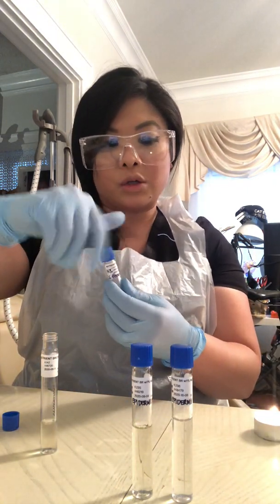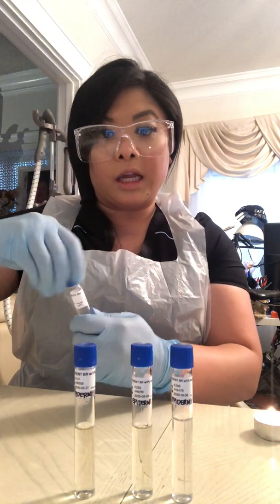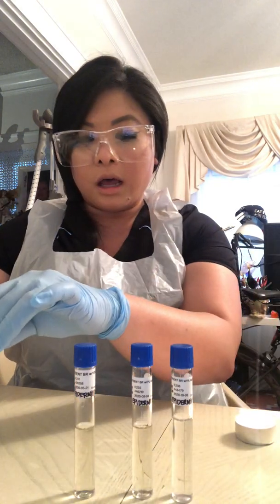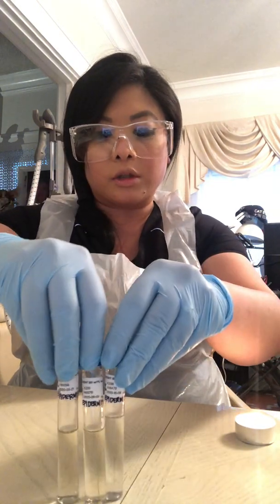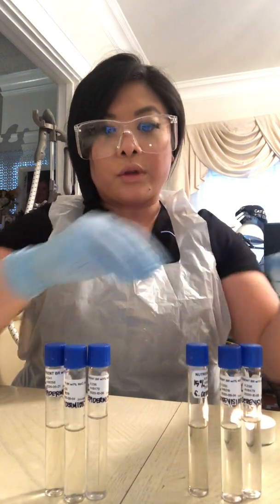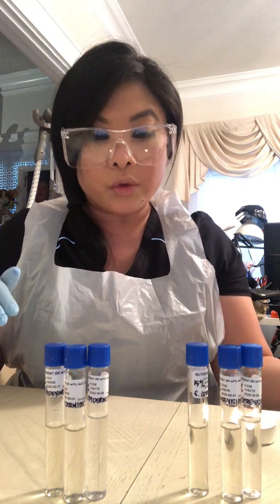So with my 6 sodium chloride tubes, I will put them in my incubation location for 48 hours. After 48 hours, I should see some growth in my tubes. If there is no growth in 48 hours, then I will do an additional 24 hours. If still there is no growth, then that would be a negative result.